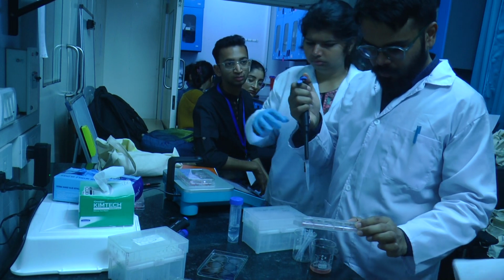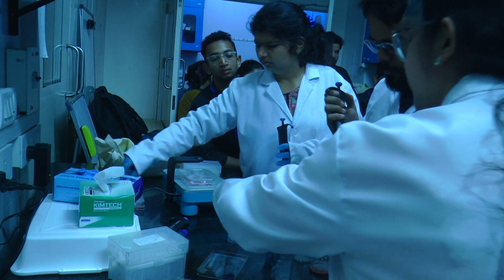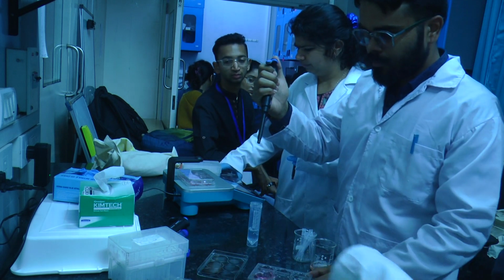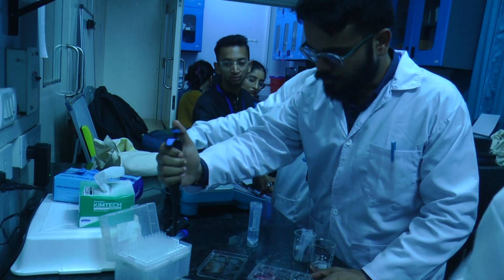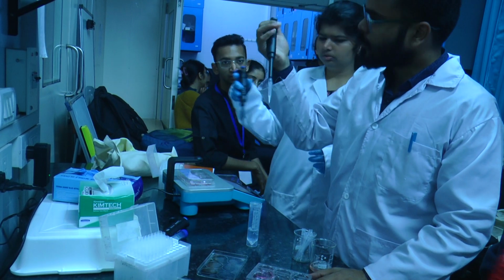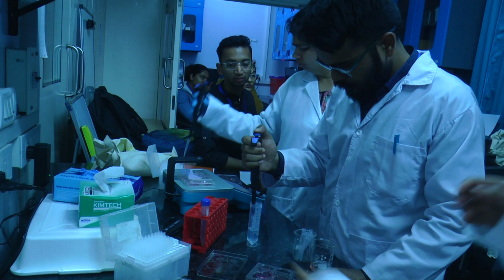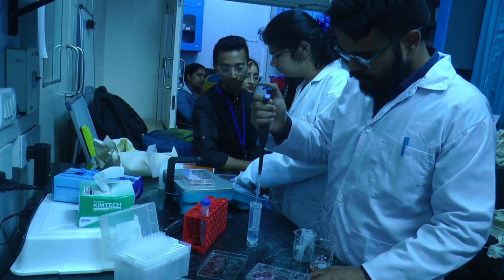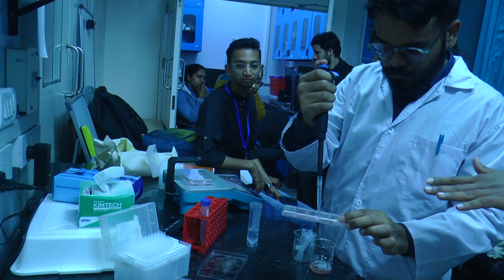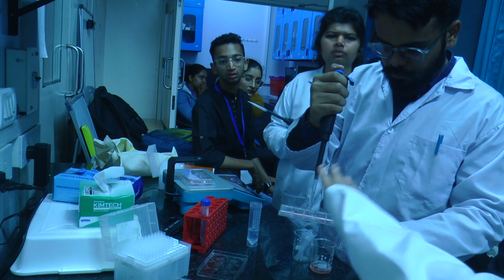Okay. Now you can discard this tip. Discard it in your hand. Take 1 ml of this. So is it made up of glass or...? Bottom is glass, but above they are fiber.